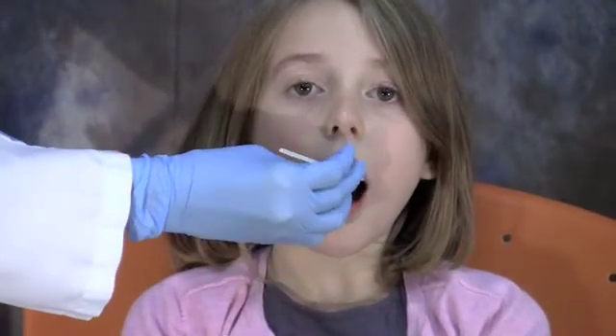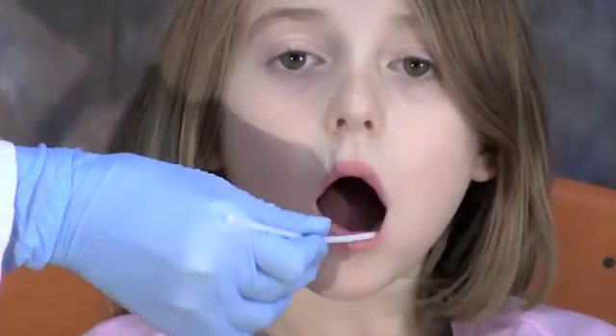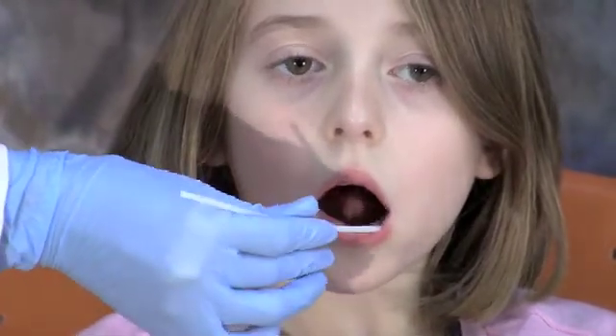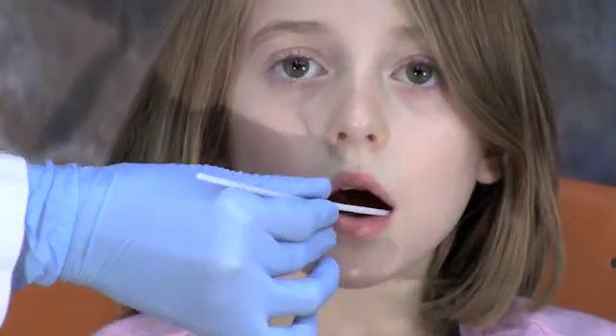For the second brush, we're going to again swab the left cheek. For this brush, try to swab an area that you did not swab with the previous brush if possible. Can you open your mouth again, Una, as wide as you can? Again, twirling the brush, go up and down on the cheek a minimum of five times. With the same brush, then go into the lower gutter — the area between the gums and the cheek — a minimum of three times. When you're done with this brush, place it into a new tube.